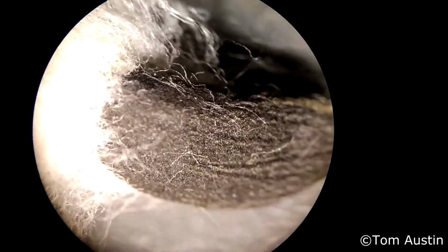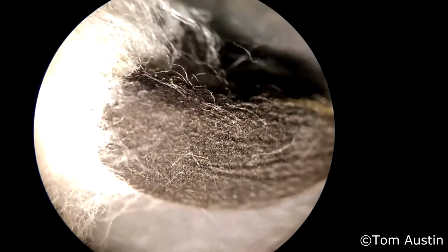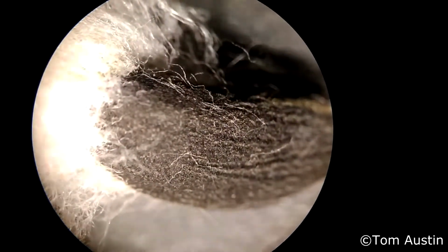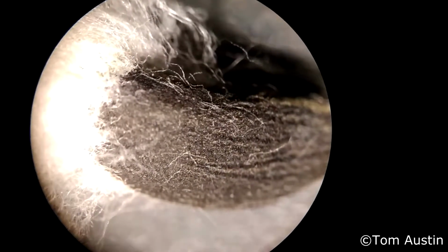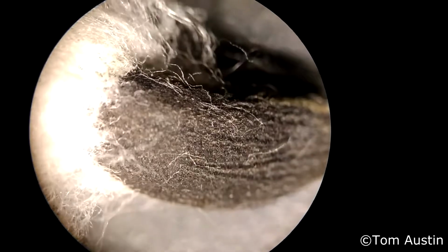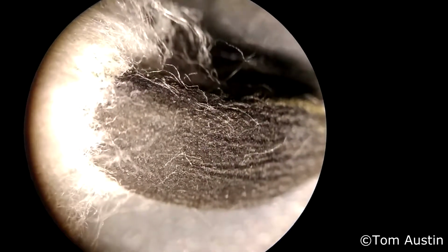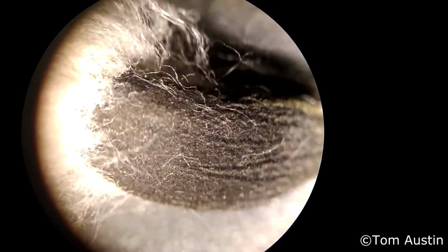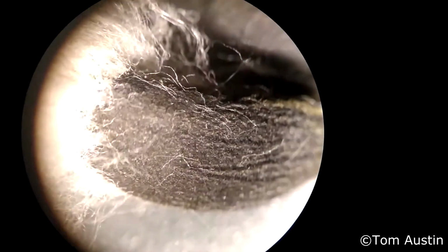Notice the hairs emerging from the seed coat, just sort of sparsely the whole way down. And this is, in fact, black seed cotton. There's no greenness to this, no redness, and no errant fibers emerging from the seed coat. There is a little bit of fiber emerging from random spots in the seed coat, but that's to be expected, especially down the dehiscent lines of the seed coat.